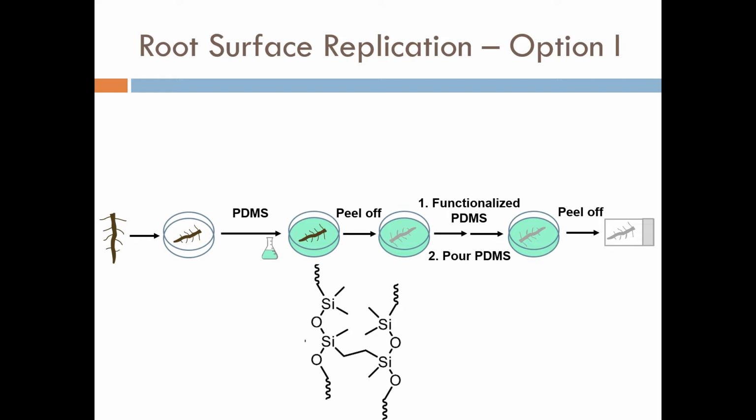It's transparent, it's commercially available, and fairly cheap. And these are the best results that Neta from my lab got, which are not bad, but are not the best, I think. You can definitely see how we can generate the cells. We can see a lateral root emerging, and we can capture the root hairs to some extent. Root hairs are actually our biggest problem, and are kind of an important structural feature to just give up on.